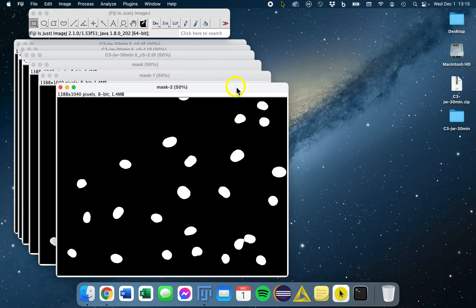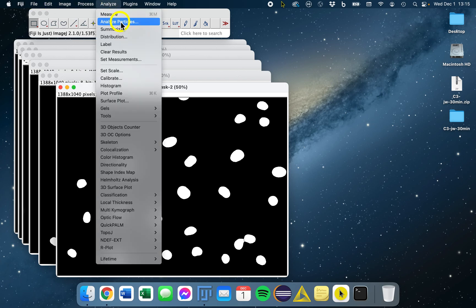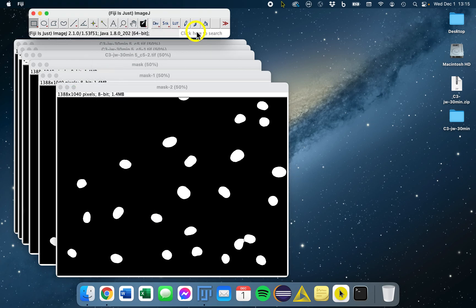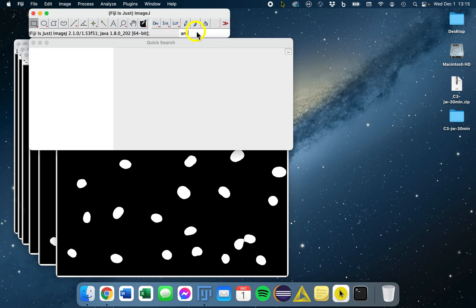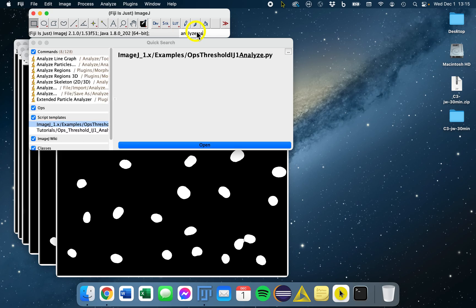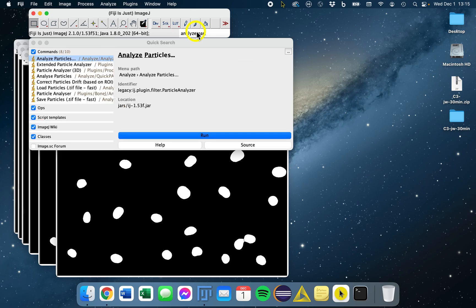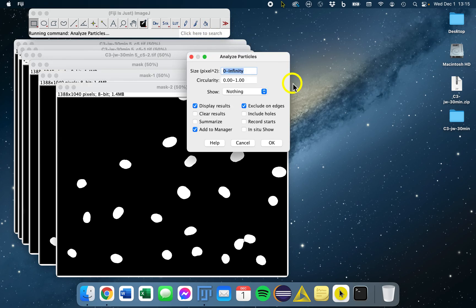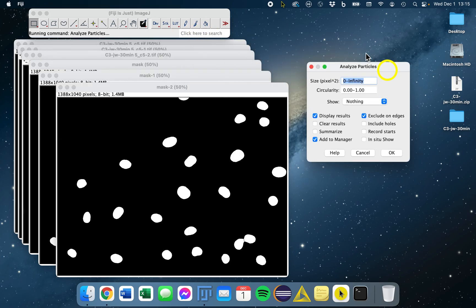We'll work on the duplicate. For Analyze Particles, you can go to Analyze, Analyze Particles, or just search for it in the search bar. And here's the window.